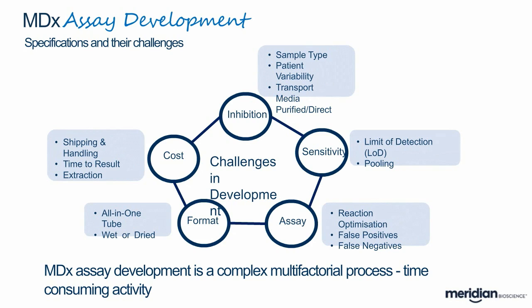On top of the reaction chemistry, we will go through experimental steps to ensure that your results are reliable and free of potential false positives and false negatives. Finally, I will talk about considering format and how the customer will handle the product and what steps you can take as a developer to make things cost-effective.